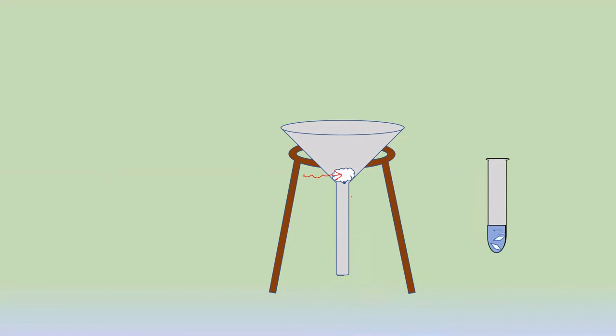Okay, so now next part, allow this particular test tube to cool to the room temperature. जैसे तुम room temperature पे cool करोगे, you can see the crystals of the benzoic acid are coming out. Okay, this is expected. Okay, तो इसको allow करो to cool it to the room temperature. So what is the next part? We are going to filter these crystals.